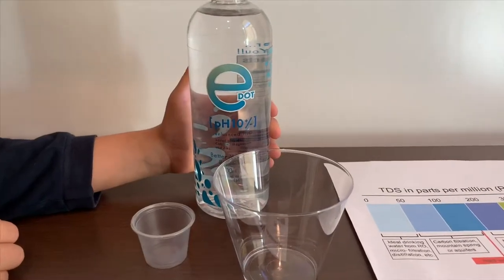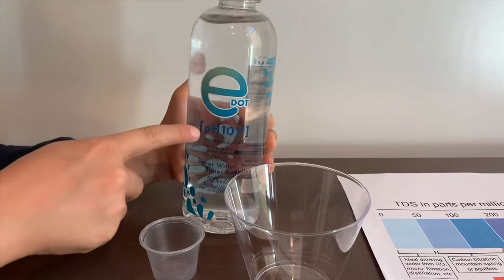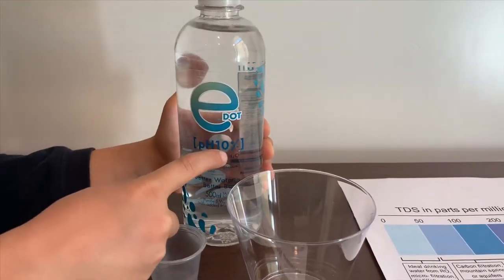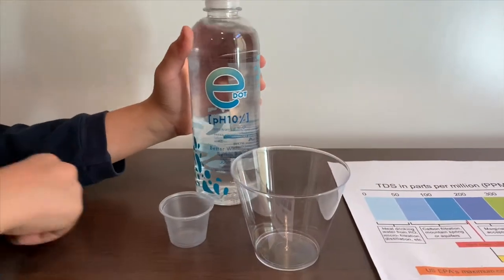This is EDOT Purified Water with Added Minerals. It says the pH is supposed to be around 10, and it costs $1.19. Let's test the pH and TDS levels.